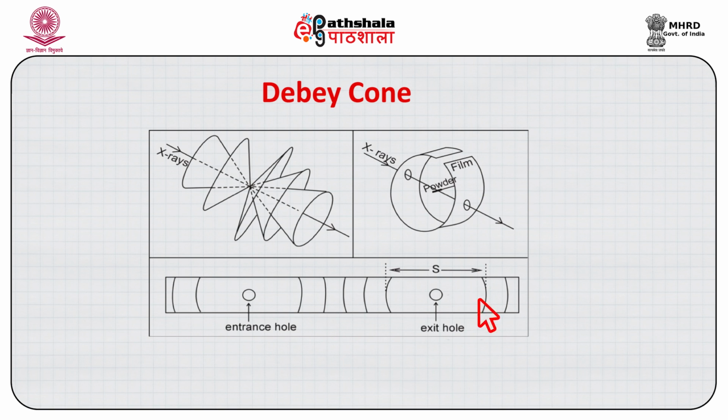But if there are intergrowths present, and minerals with complicated structures on account of impurities in their composition, this can lead to variation. But it does provide us an identification tool for minerals which cannot be identified otherwise.